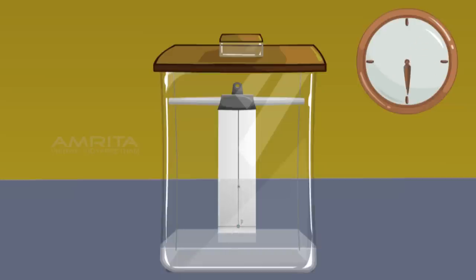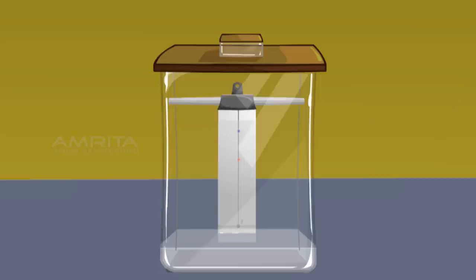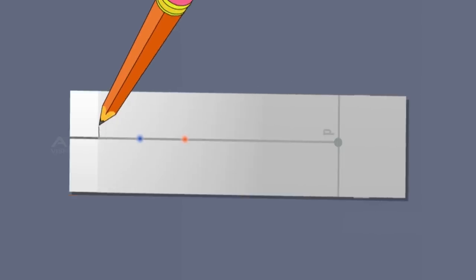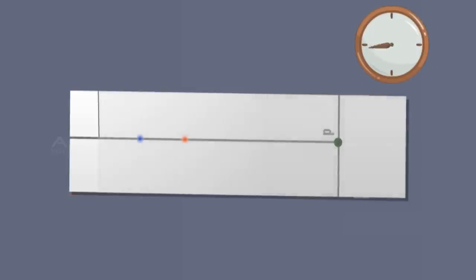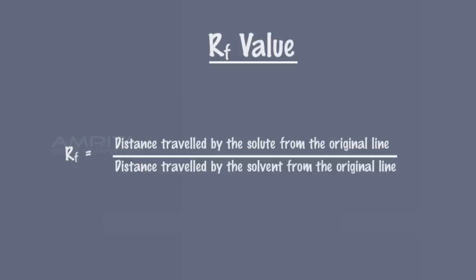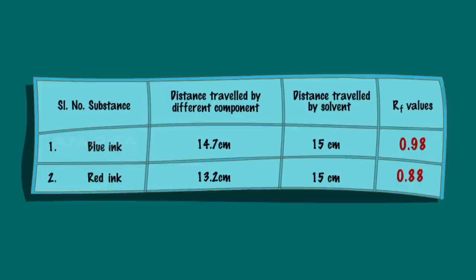Notice the rise in solvent along with the mixture of red and blue ink. When the solvent has risen about 15 cm, you will notice two different spots of blue and red colours on the filter paper. Take the filter paper out of the chamber and mark the distance that the solvent has risen on the paper with a pencil — this is called the solvent front. Dry the paper and put pencil marks in the centre of the blue and red spots. Measure the distance of the solvent front from the original line and the distance of the two spots from the original line. Calculate the RF values of the blue and red inks using the formula.